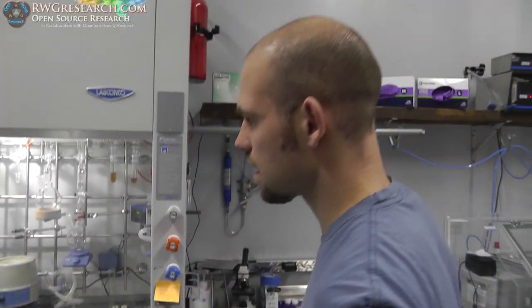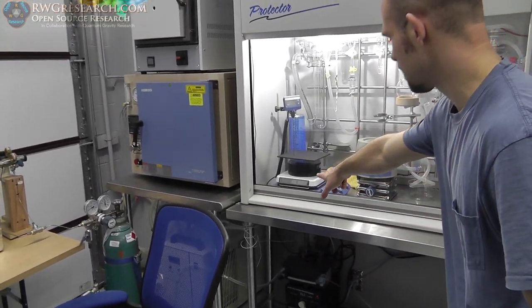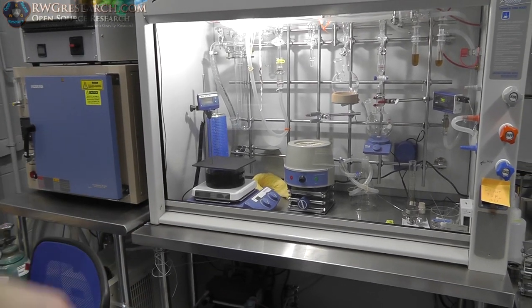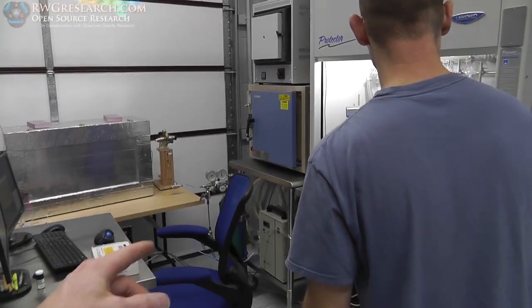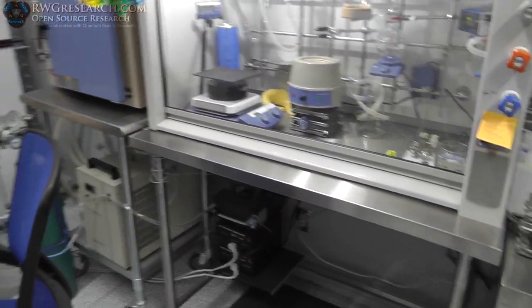So I didn't get the one with those little spinners in it. What's the liquid you got here? That's just oil. Okay. So you can put your flask in the hot oil, and it's an even temperature of heat. Oh yeah, it disperses the heat evenly. And then a vacuum or a chiller for the system.